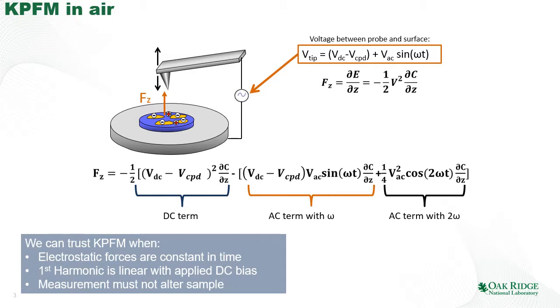Using these very simple equations, we can either probe the classical surface potential, as in KPFM, by using the feedback circuit to nullify the first harmonic term, or we can introduce alternative versions of KPFM if we calibrate the transfer function or use more complex excitation methods.